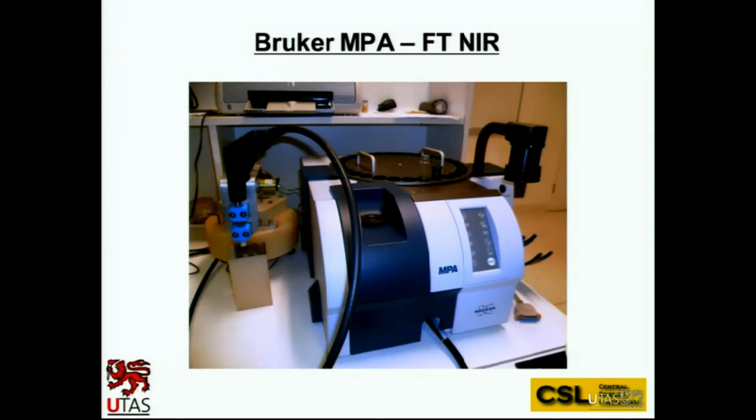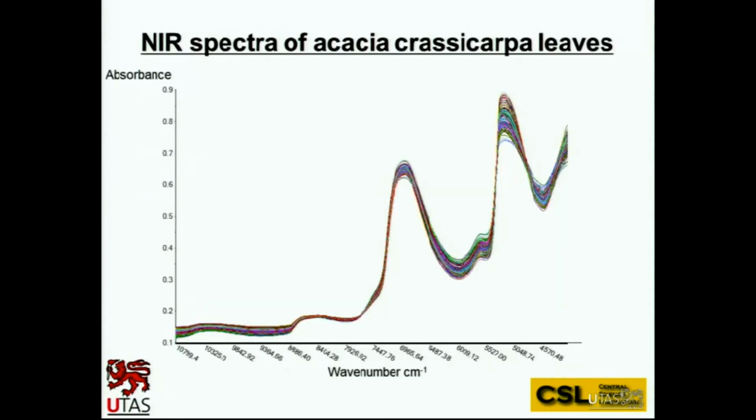We have got a big auto sampler that we use for grapes, for example, where you can simply put grapes or any sort of grain in there. You don't need to crush it up. It will actually homogenize it by rotating that big vial around, and you can just simply analyze grains or anything like that straight up. You don't need to do any further sample preparation with it.